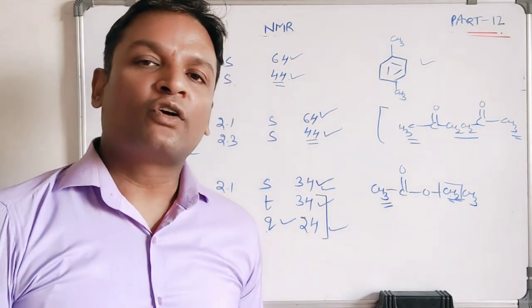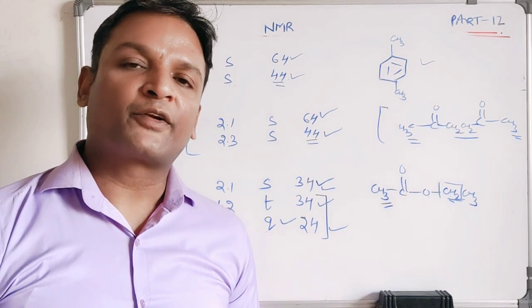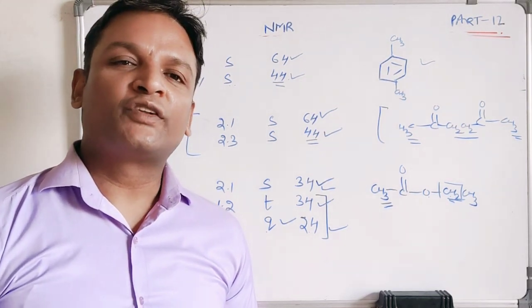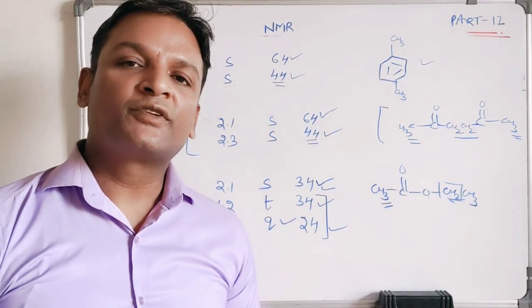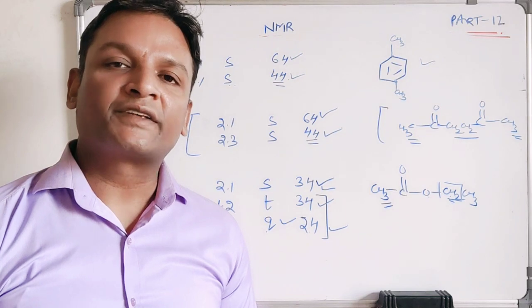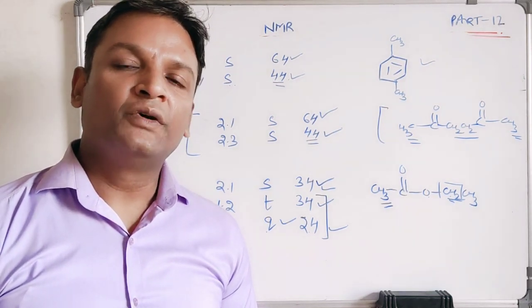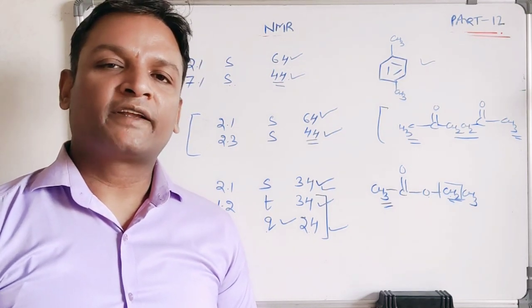So by doing all these examples, I'm sure that now with the help of NMR spectroscopy, when you're given the NMR spectral data, you can find out the structure of different simple compounds, because in the syllabus it's just simple compounds we have to discuss. So structural elucidation you can do effectively if different compound data are given to you. So I think it must be clear to you.